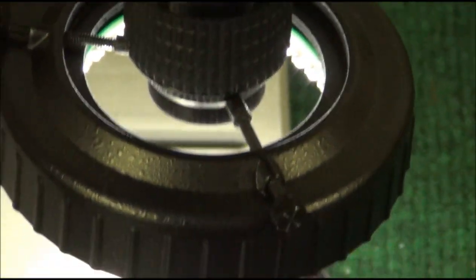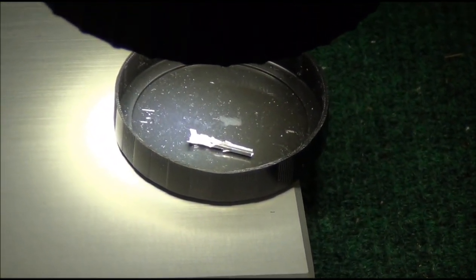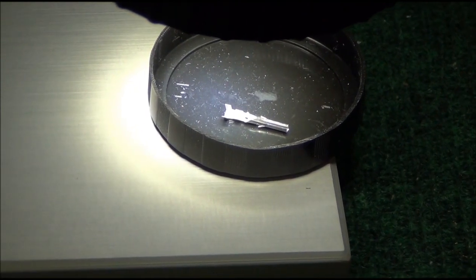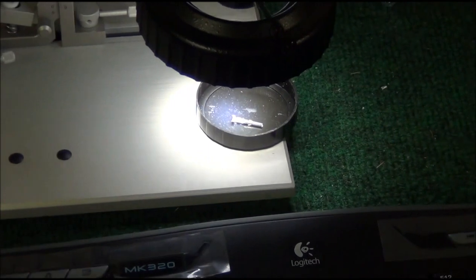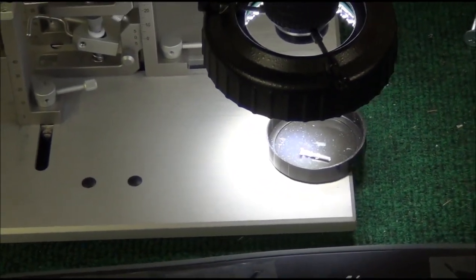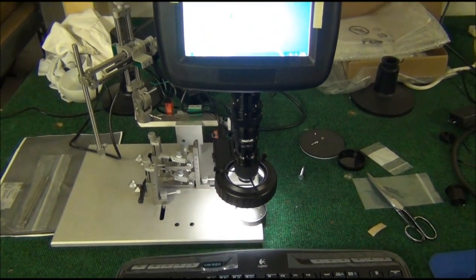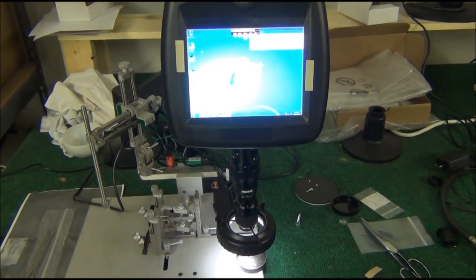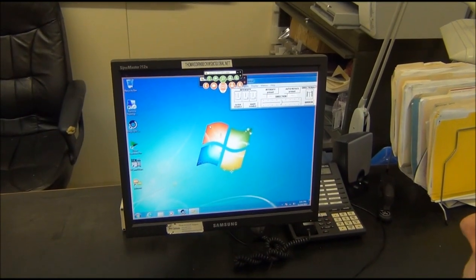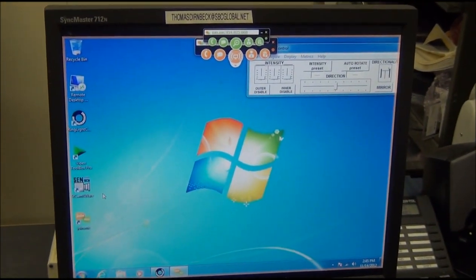While we're back here, you can see all we are looking at is just a little wire crimped part. This could be any part. It could be a forensics bullet, it could be a ring, it could be whatever you're looking at in your speckFINDER application. So now we're going to head back to Ann's office and take control of the speckFINDER system.